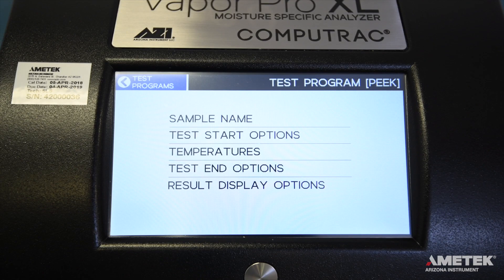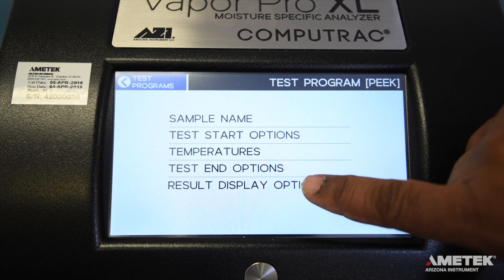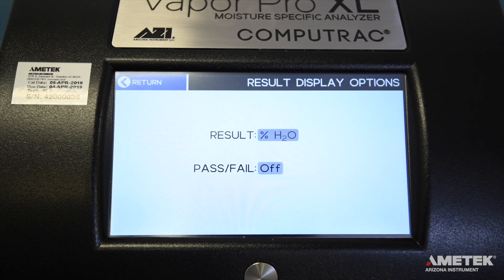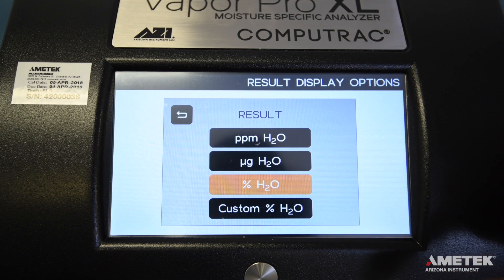The next parameter to edit is Result Display Options. It is the last one on the list, but because a field on this screen can alter the viewable fields on the Test Start Options screen, we will edit the Result Display Options first. Once you select Result Display Options, you'll need to choose the unit that you want your result to display as. The Result Display Options are PPM, Microgram, and Percent Water.